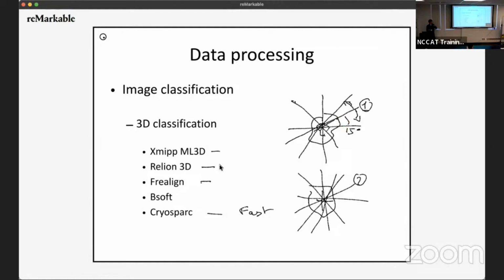And it might fit relatively well to one angle and less well to the second one, and so on. But then if you look at reference number 2, same 15 degrees, with that accuracy, it might say, oh, I prefer number 2, actually. Number 2 seemed to be better.